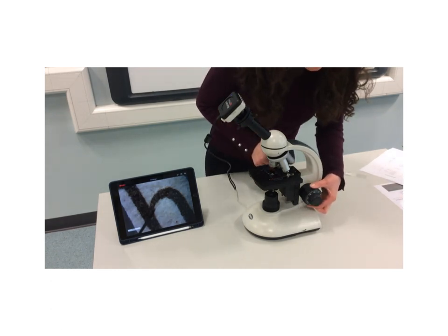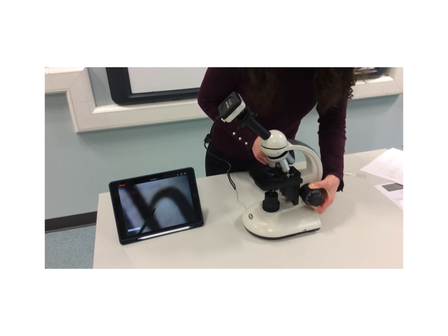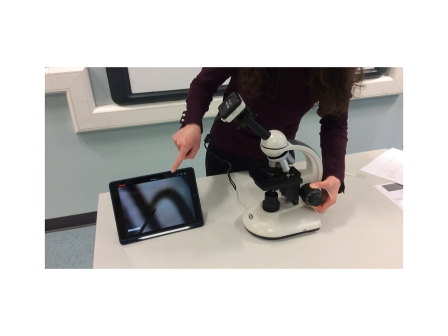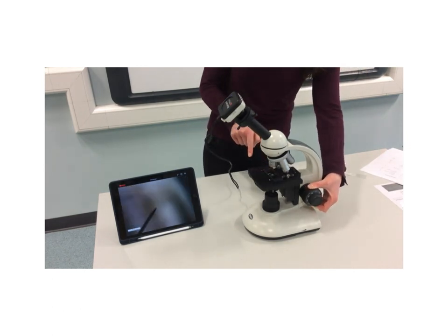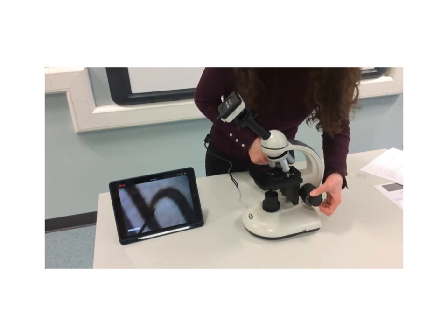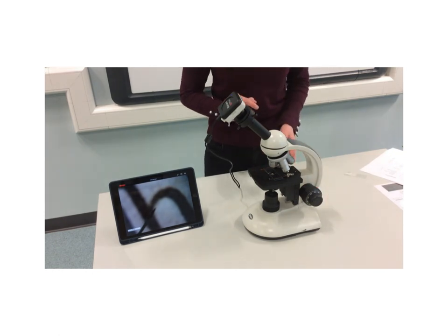But you can see that we've got our focusing wheels or our focusing knobs. The bigger one is what we call the coarse focusing knob, and you can see actually I've got it on to an image here connected to my iPad, and you can see that coming in and out of focus, and hopefully you should see it moving the stage up and down as well. So that's the coarse focusing knob, and then the fine focusing knob brings it into greater detail. We'll look at that in just a wee second as well.